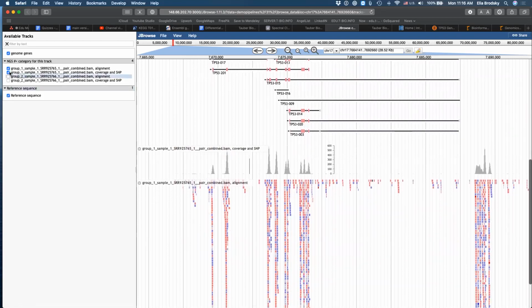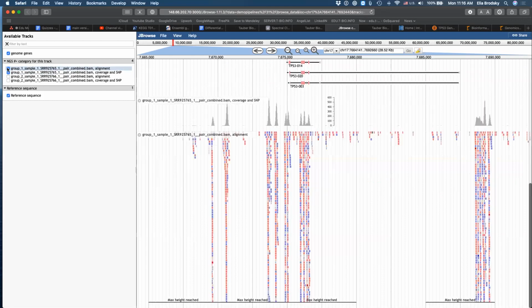Because these are the two samples that we are looking at, sample one, sample two right here. So these are different SRA archives. So those are archives of FASTQ files that you can find on NCBI. No, these are not from the 1000 Genomes Project. This is from a project that has human patient-derived cell lines from breast cancer.